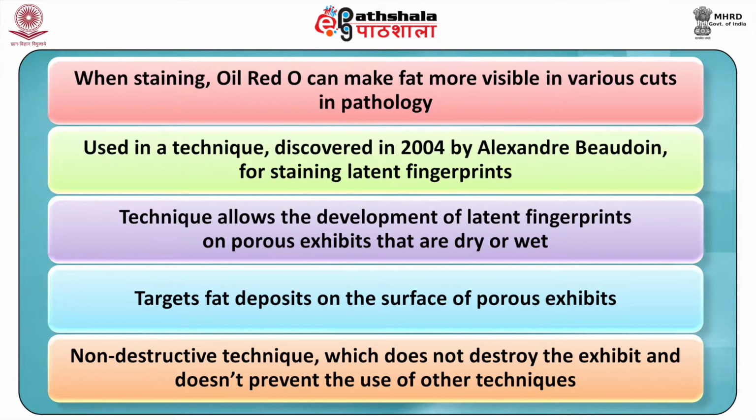It mainly targets fat deposits on the surface of porous exhibits. It is a non destructive technique which does not destroy the exhibit and doesn't prevent the use of other techniques.